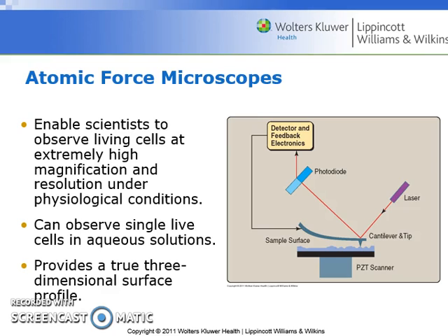When they do this, the scientists are able to see specimens inside of a solution that has been generated in order to allow those organisms to thrive and live. So it's kind of like observing bacteria in pond water, just like Antoine van Leeuwenhoek did. But you're just using a more powerful microscope to do that.